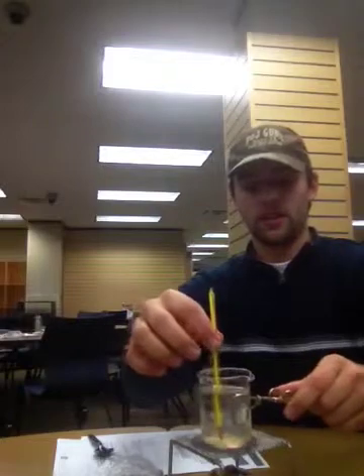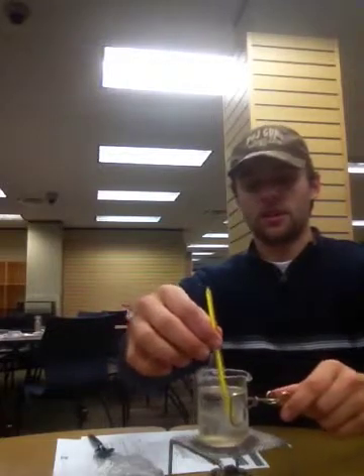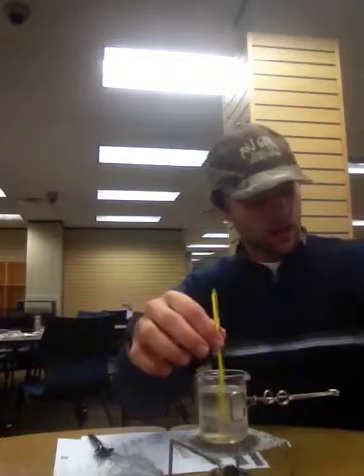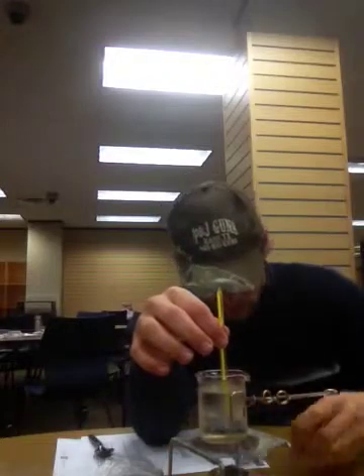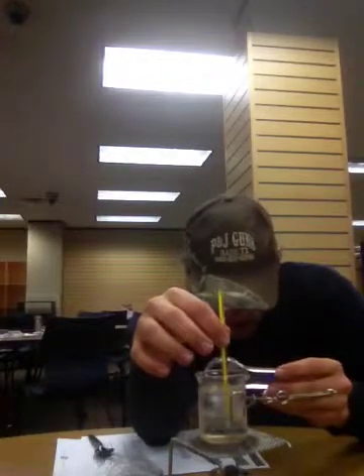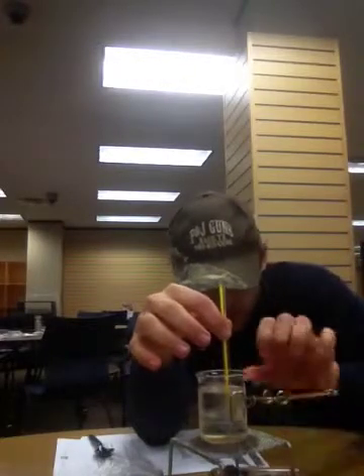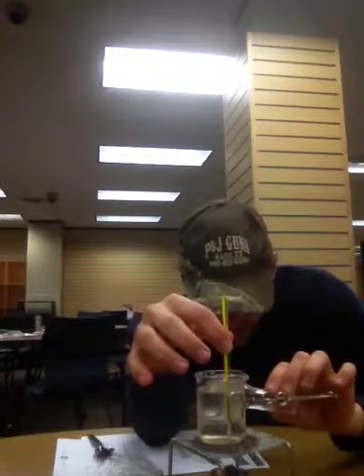We have a starting temperature of 25 degrees Celsius, and we will begin the heating. You have to let the glass heat up slowly, otherwise it may crack. So initially we have a slow warming. I have a little magnifying glass here so I can watch it closely, wiping off the fog. It's fogging up already again, but it's okay because it's not melting yet.